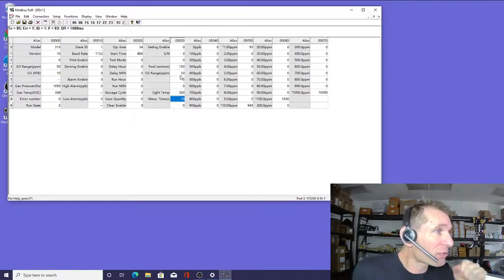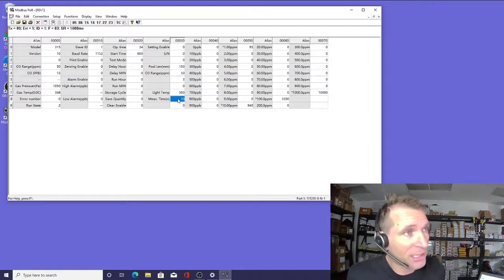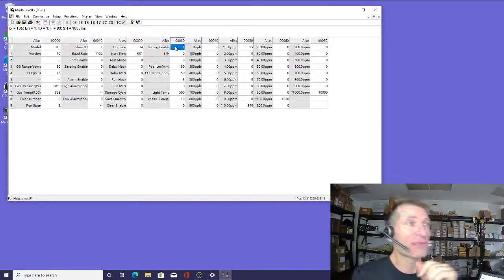Dr. Kaz, how do I change the sampling time? Okay, folks, you could do this here. Now, if you want to make any changes, you first have to go to Setting Enable. You have to double click. It comes up. You have to make that 1, okay? And then I like to click on that. So when I press Send, it closes the window. That makes it 1. That enables you to make the changes to the registers. If you don't do that, you're going to have problems.